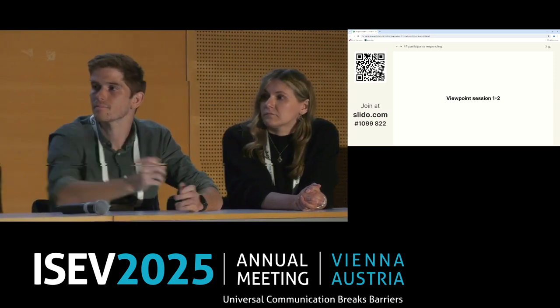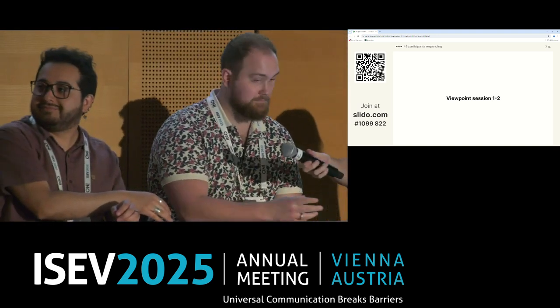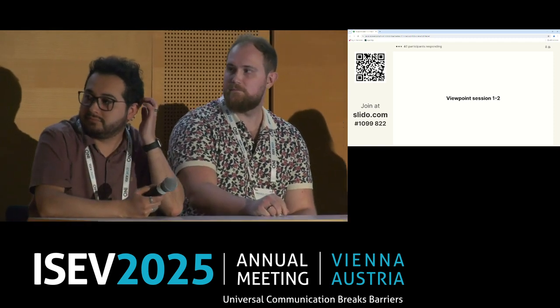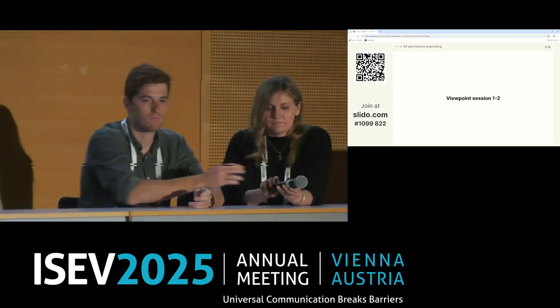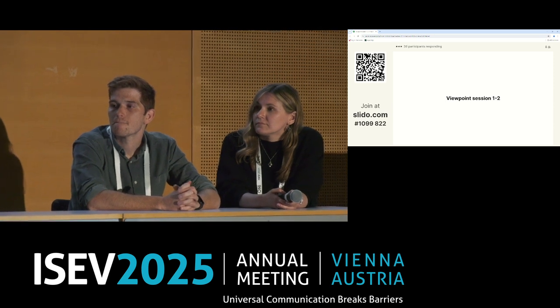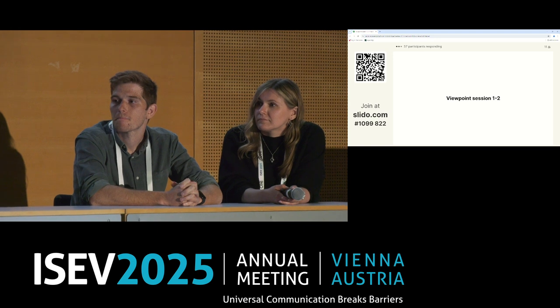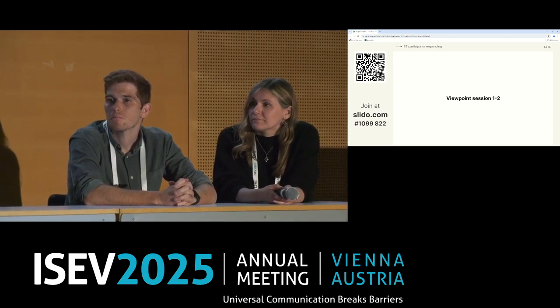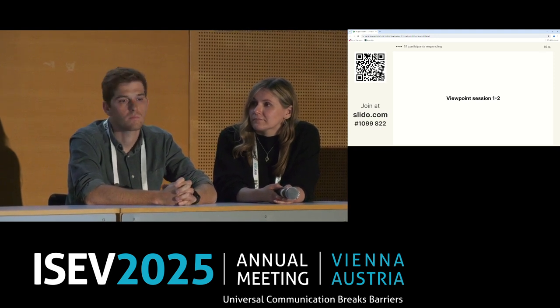So Cristobal, as a follow-up, because you're more on the functional side of EV analysis, do you have particular considerations on that point of view, like how do you want to preserve the biomolecular corona and the EV heterogeneity to ensure the functionality is maintained after preparation? So at what level do you see preparation for functional studies on extracellular vesicles?